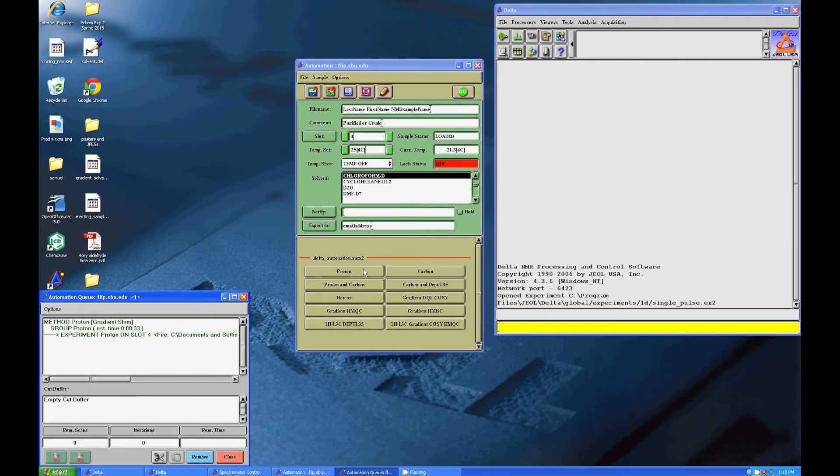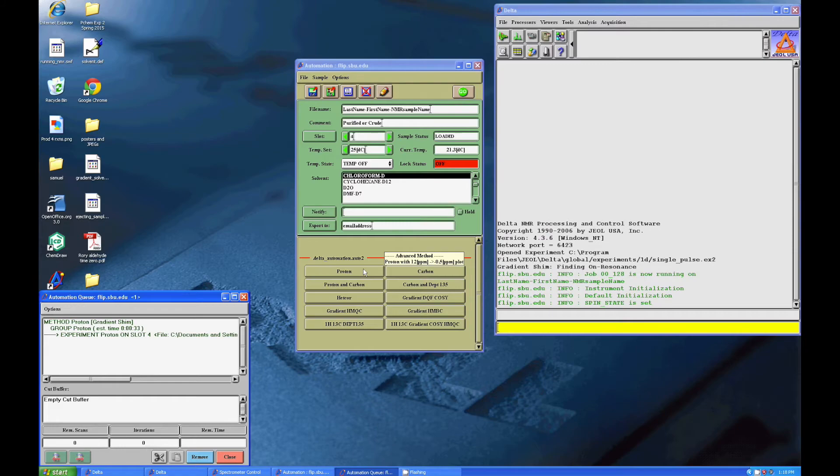When you click it, you'll see the notifications start to come up as your NMR sample begins to run.